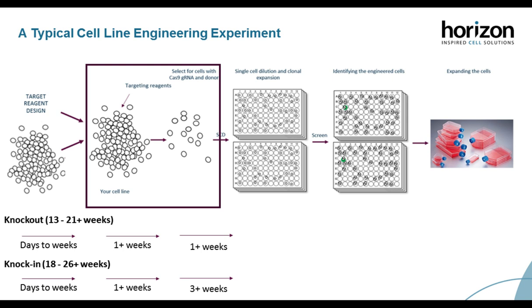So what we always do in the gene engineering department is characterize our cell lines to make sure that we can genetically engineer them and be prepared for these time delays and hindrances to our research plan. It's just all about the preparation in this area.